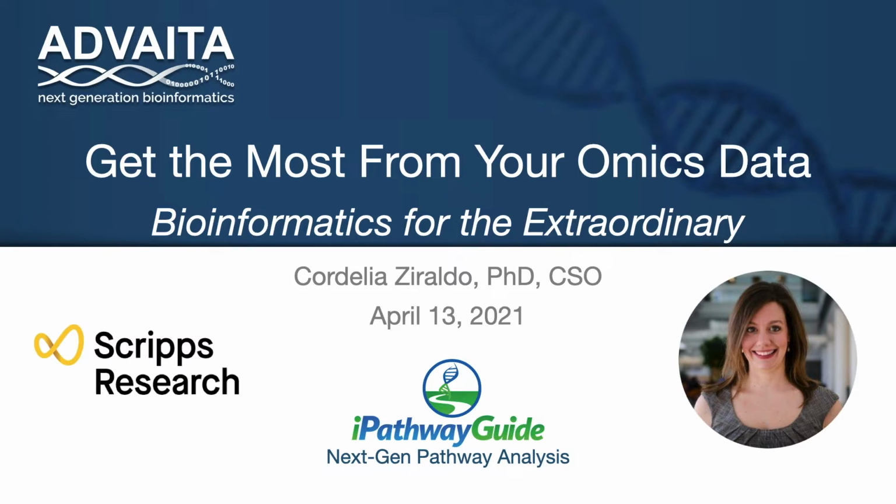We also know how pathway analysis is done in Advaita in comparison to other similar tools. And we also know that Advaita generates automatic reports and has data sharing ability available with Advaita's iPathwayGuide. Today's session will be a deep dive session on some special aspects of iPathwayGuide.